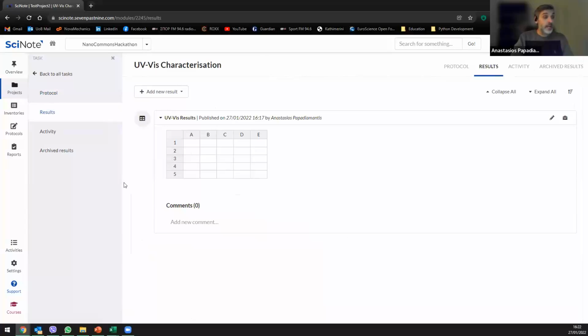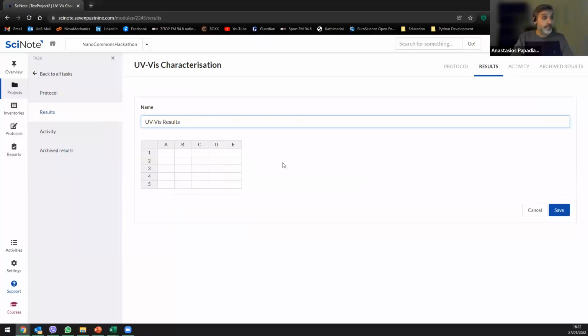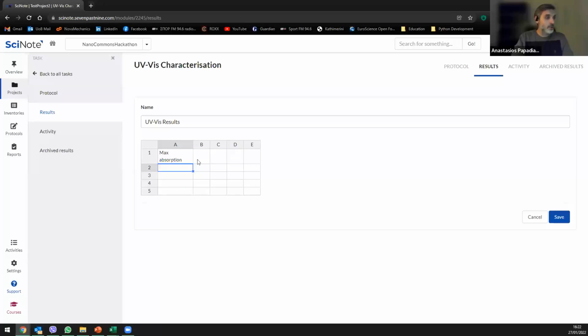So going back to the results, again, we click the edit button. We can change the name. If we want to record what we saw, the max absorption, we say 512, 511. This should not happen with the UV-Vis, but it's just for demonstration purposes.